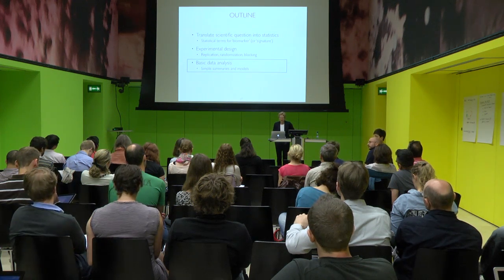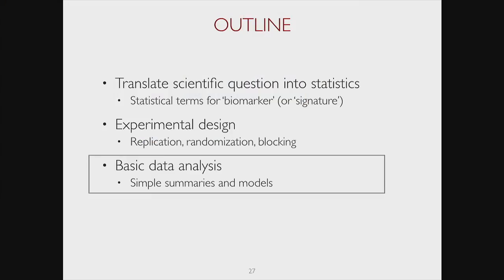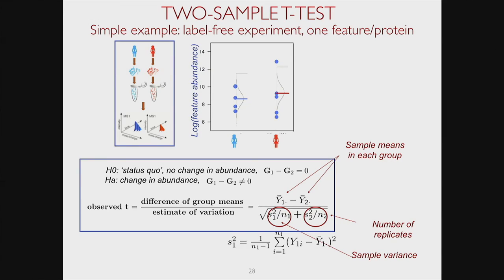Okay, so let me start a little bit talking about data analysis, and I will finish when we run out of time, and then I will continue again on Thursday with that. So let me just walk you over a very simple approach, essentially comparing two groups using a t-test. And I would like to do this because I would like to clarify some important concepts which sometimes get mixed up when we do this comparison. Then on Thursday I will talk about additional things.